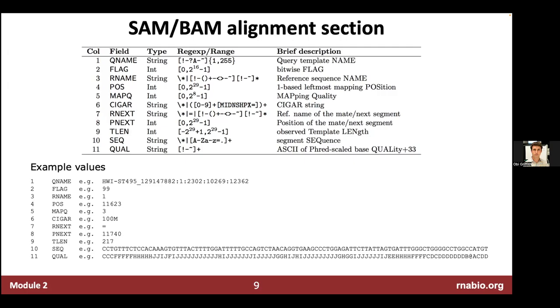One of the key pieces of information it would consider would be the base quality of the reads that say T at that position. A common thing would be that maybe there's some sequencing errors that introduce a T, but they're actually low Phred score. So the algorithm would use that in its logic or heuristics or statistics to determine whether that's a real variant or not. And there's probably lots of other applications.